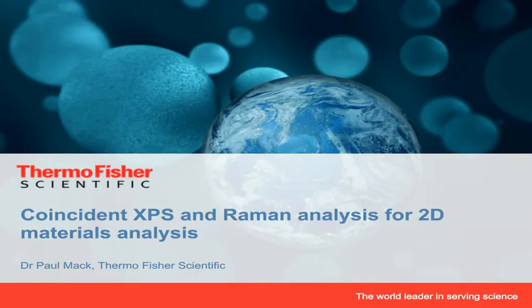Welcome to the first part of this webinar about multimodal analysis of 2D materials. This talk is about 2D materials analyzed by a combination of X-ray photoelectron spectroscopy and Raman spectroscopy, where the two spectroscopic techniques are configured on the same tool. We will briefly look at the theory of each technique and what information they can give us, and then move on to some case studies of how they can be applied to analyze 2D materials. In particular, we will see the advantages of using both techniques configured on the same instrument, enabling coincident XPS and Raman analysis.